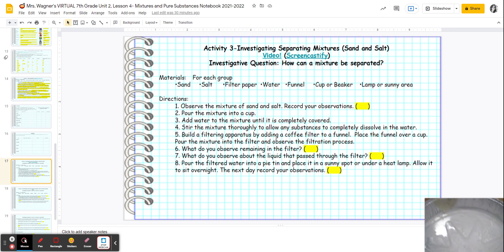And this is now what we currently have. So I'm just going to try and show you what we have. I'm just picking a little bit of the substance left. Okay, so all of the water is gone.